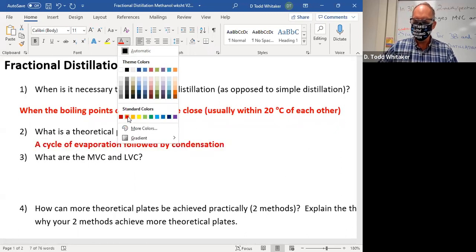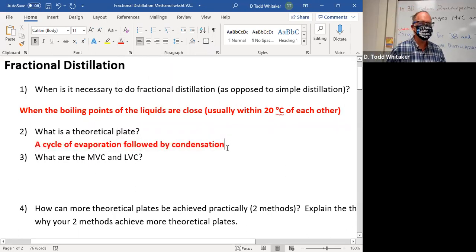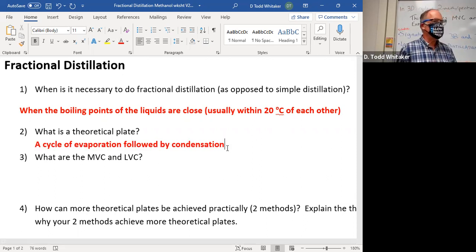What's going on? You're in a liquid state in the beginning, right? Liquid state. You heat up a liquid. That always creates more vapor than you used to have because your molecules have more energy now. If they have more energy, then more have energy enough to overcome intermolecular forces. And when you overcome intermolecular forces in the liquid state, what happens? The word's on the screen. Evaporation.